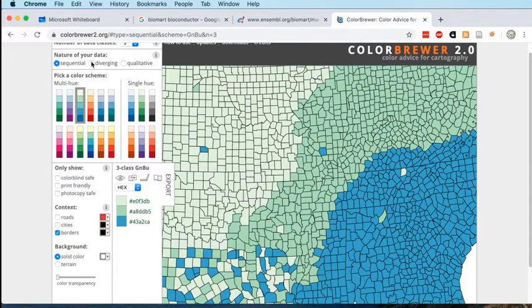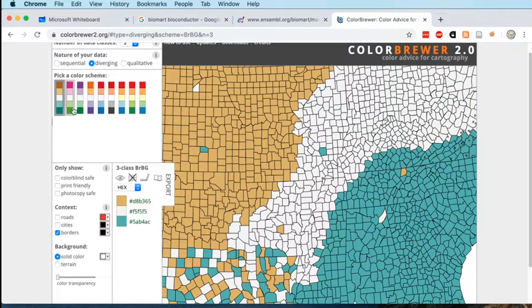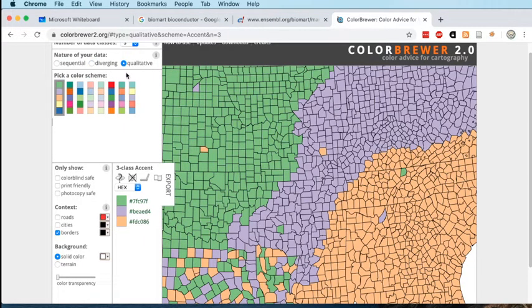On the other hand, you can have diverging color schemes as well. So here's a set of diverging color scales: purple to red and blue to red and various other things. And then qualitative gives you these panels of non-clashing colours that can be useful for things like categorization, so categories of data. So the Color Brewer palettes are quite nice, and there's quite a lot of variety available to you by using them.